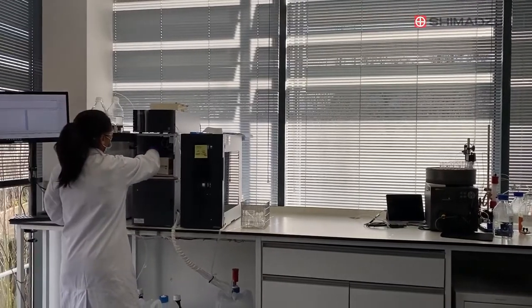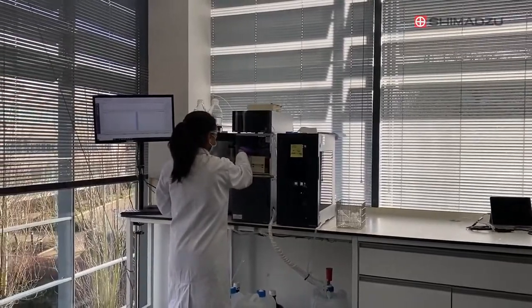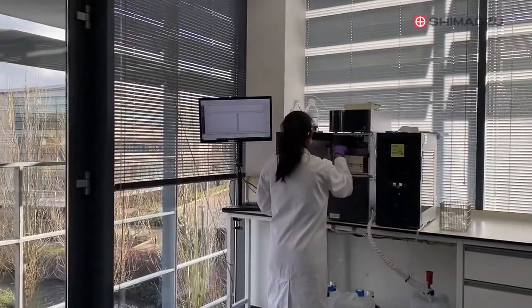And of course, when you're dealing with chemically modified DNA, there's a whole host of possible decomposition side reactions which you have to take into account depending on the nature of the modification. So the first step after purification is to separate the oligonucleotide from the buffer which it's eluted in.